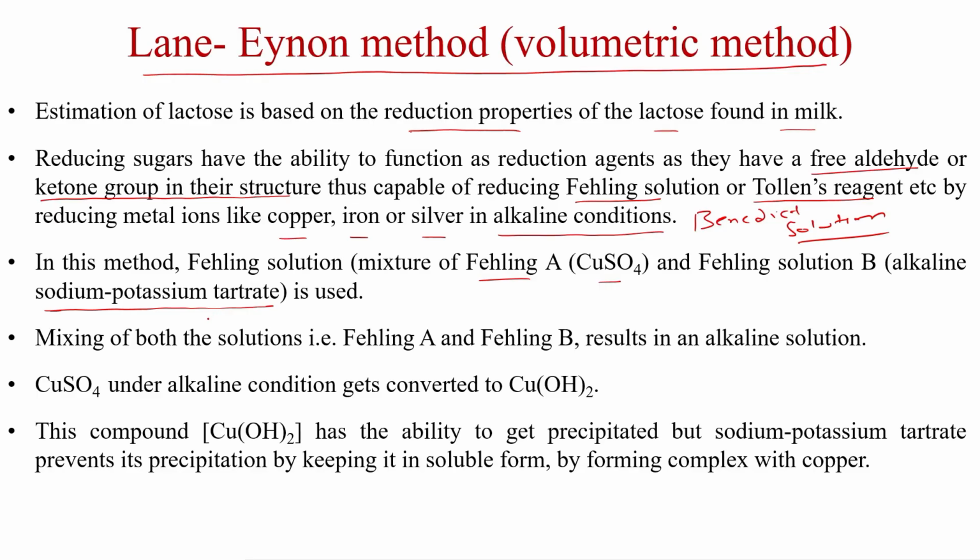If we mix both solutions, A and B, the result is an alkaline solution, because Fehling solution B also contains sodium hydroxide.